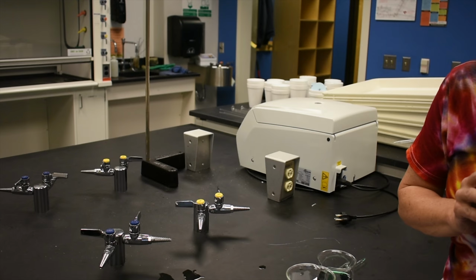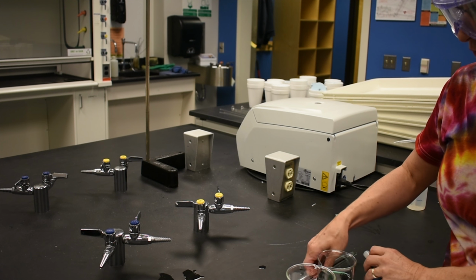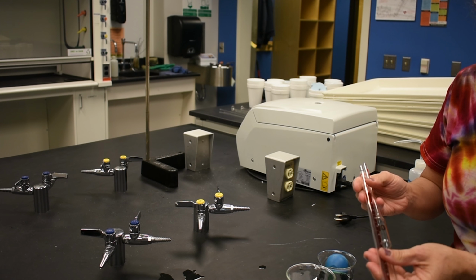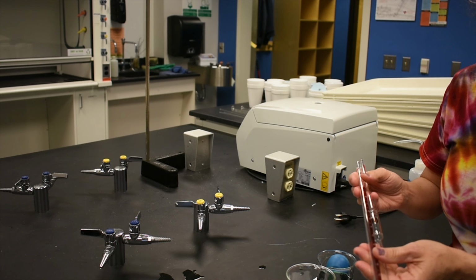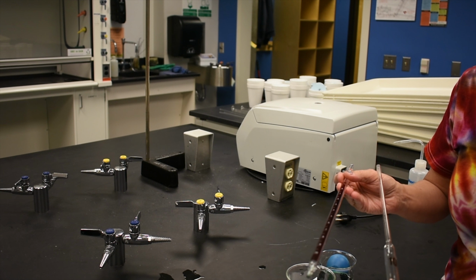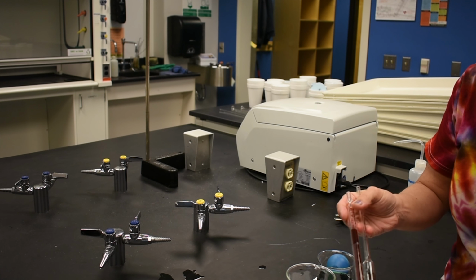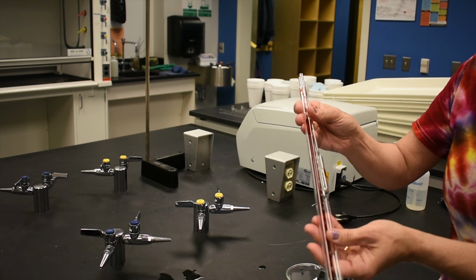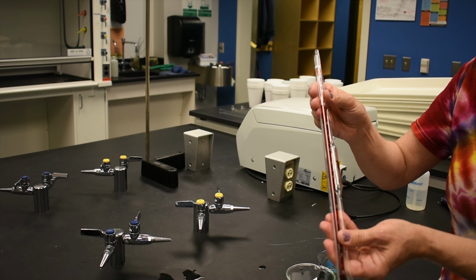In the video today, we are going to be learning how to use volumetric pipettes. Today we have two different types of pipettes that we'll be learning how to use. The first one is a 10 milliliter pipette that dispenses only 10 milliliters and exactly 10 milliliters. And the other one is a graduated pipette that can dispense anywhere between 0 and 10 milliliters.